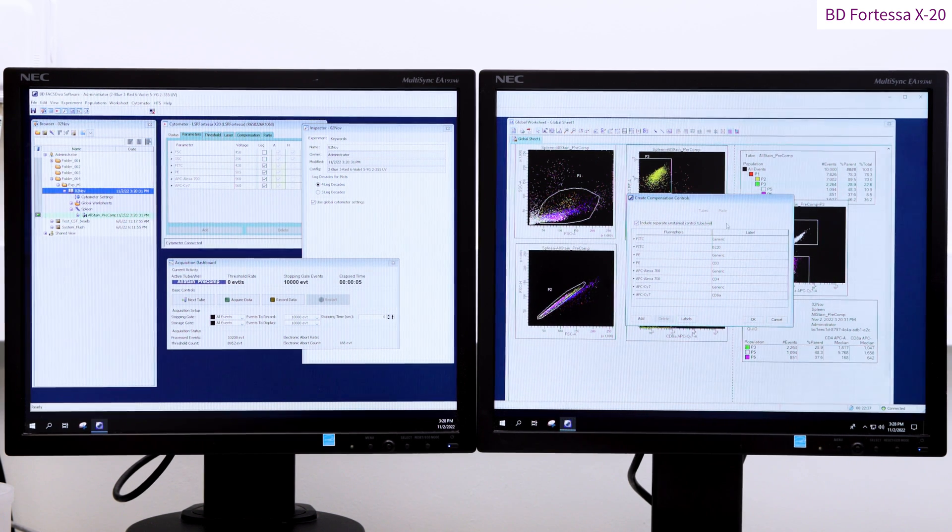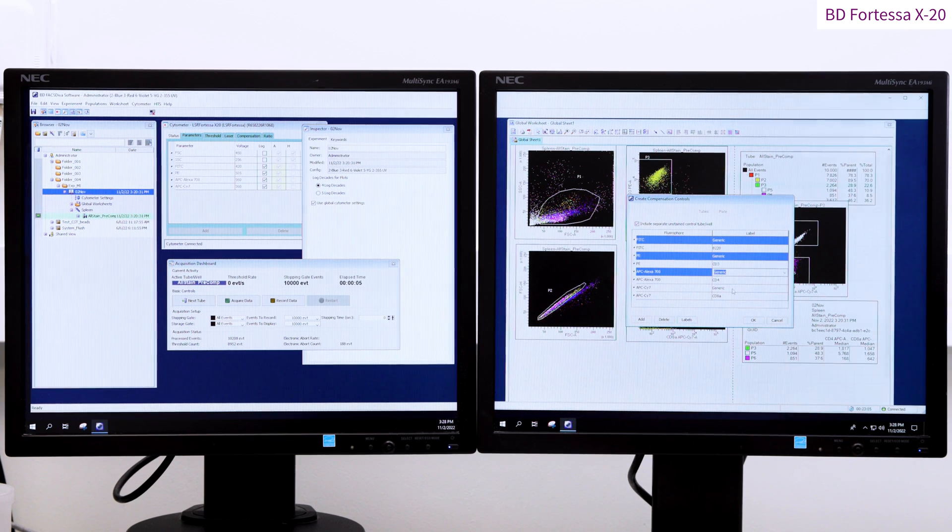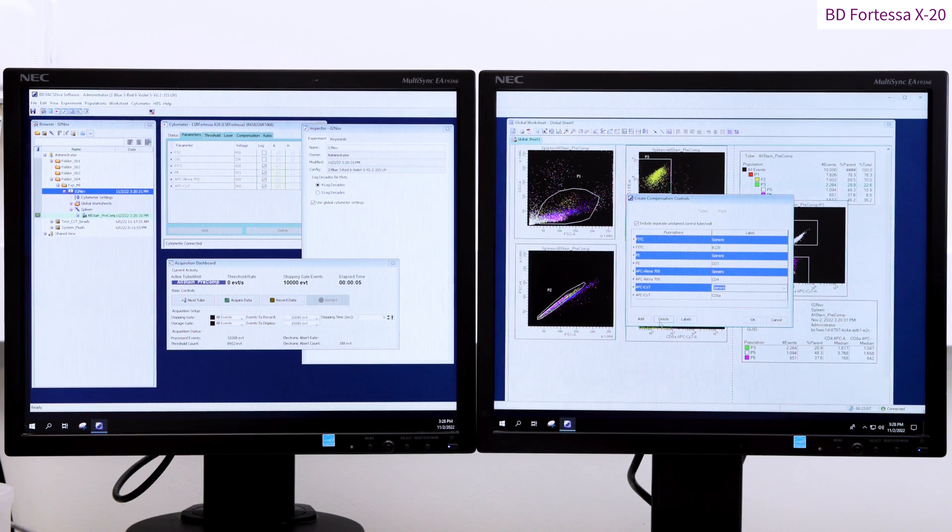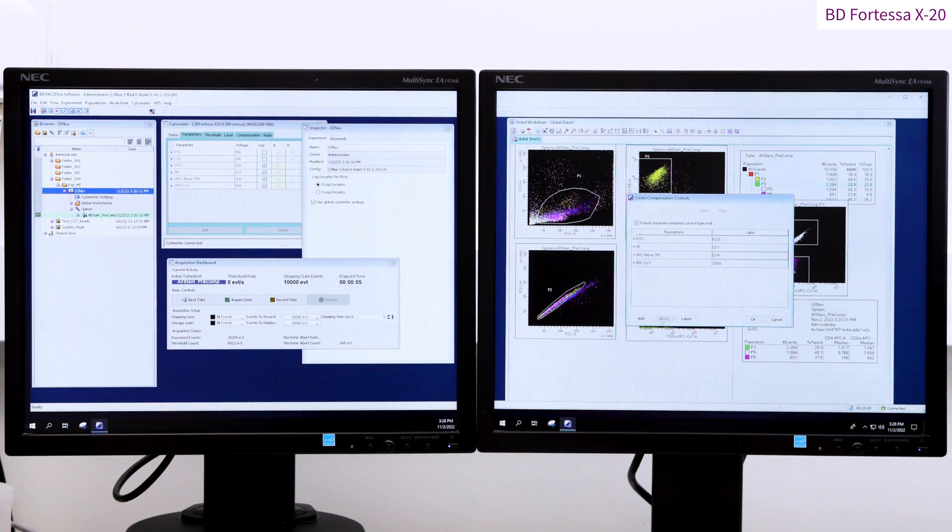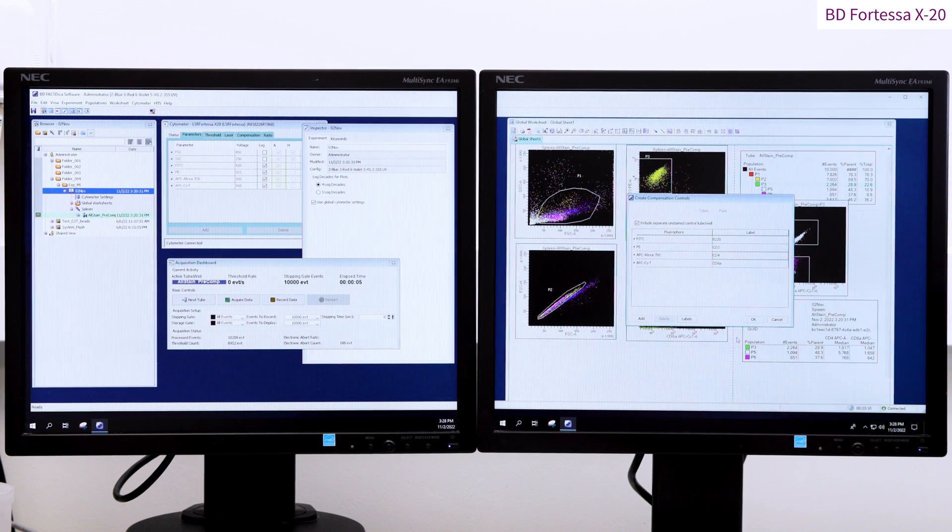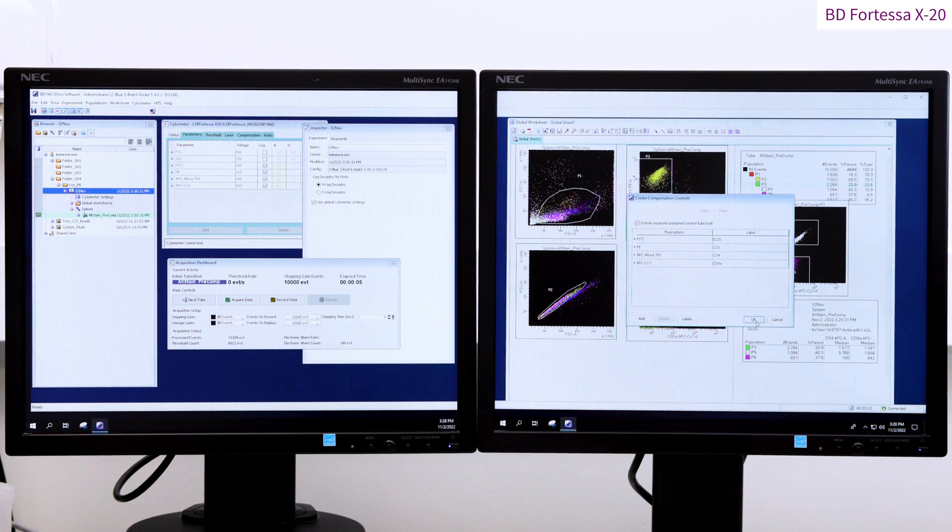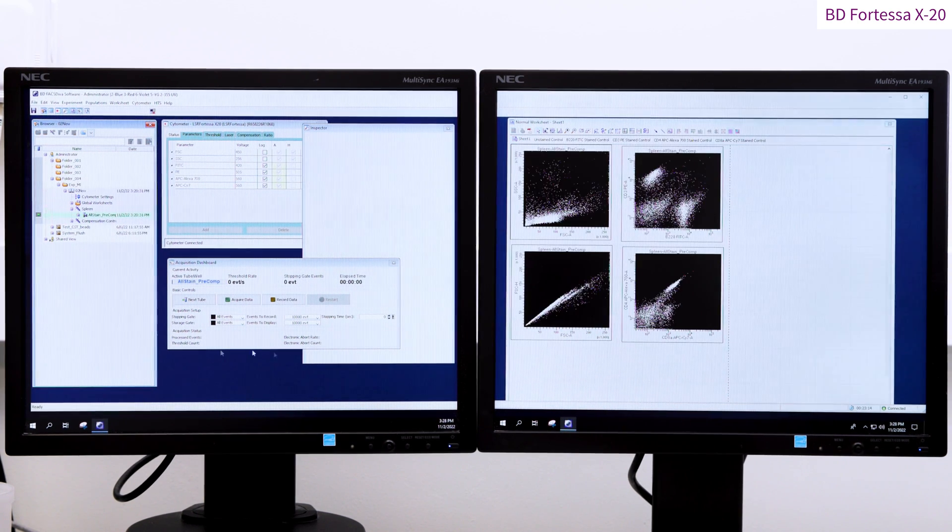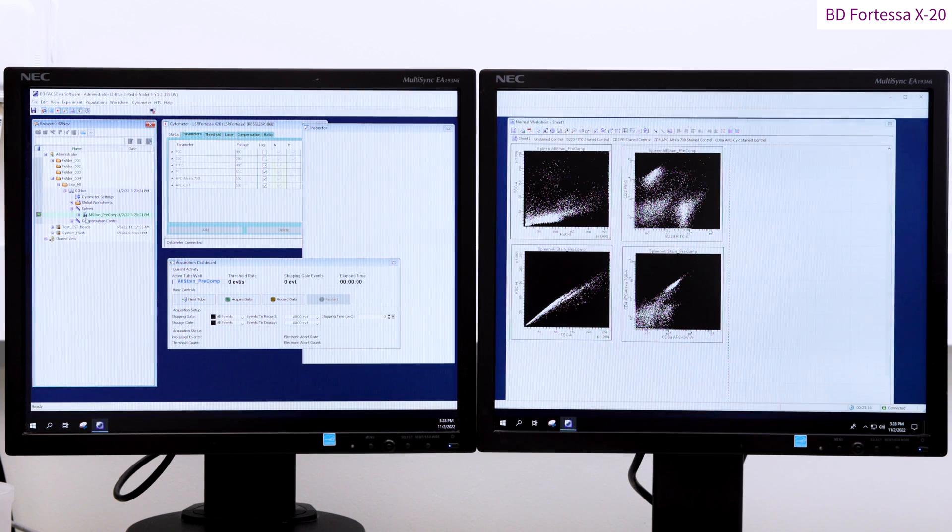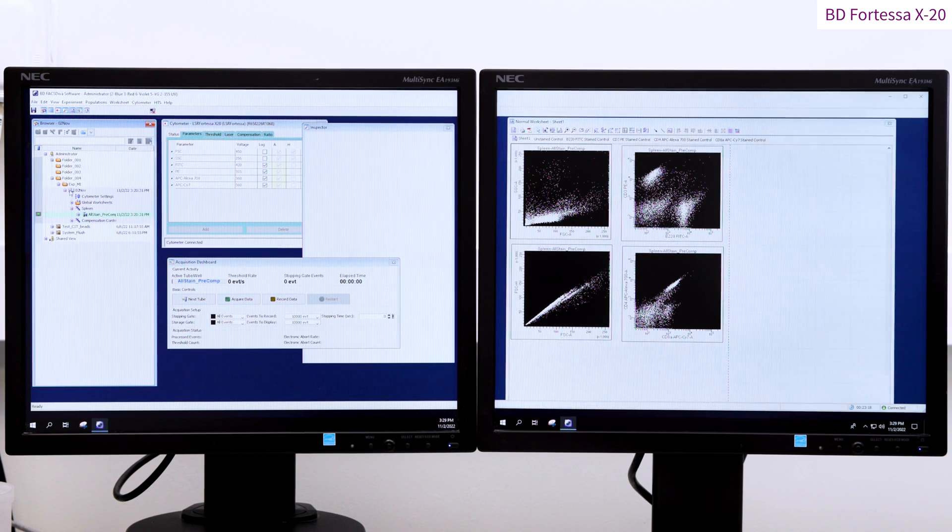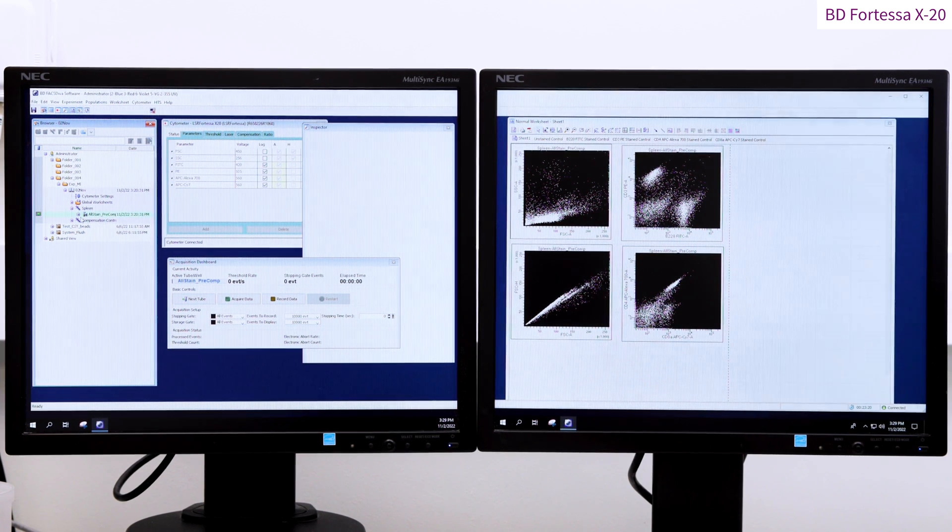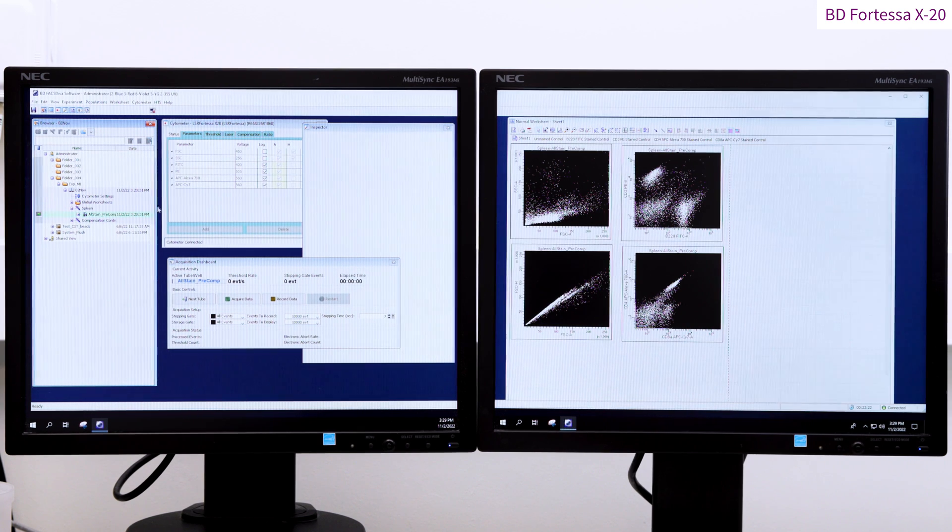In this example, we're not using one. Diva creates a compensation control specimen for each single stain sample and unstained sample we're planning to run. Diva also automatically switches from global worksheet page to a normal worksheet page that is dedicated to the compensation control specimens. By default, Diva will record 5000 events for the single stains.